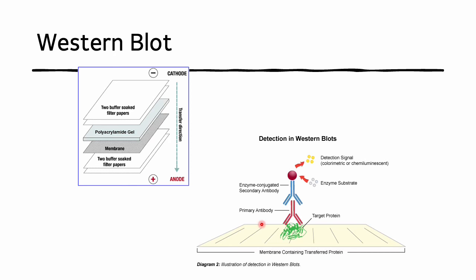In that case, those proteins take the unspecific binding, and the chance that the primary antibody has unspecific binding to the proteins on the membrane decreases a lot. So before we attach the primary antibody, we go over the blocking step, then primary antibody, then secondary antibody, then we detect the signal.